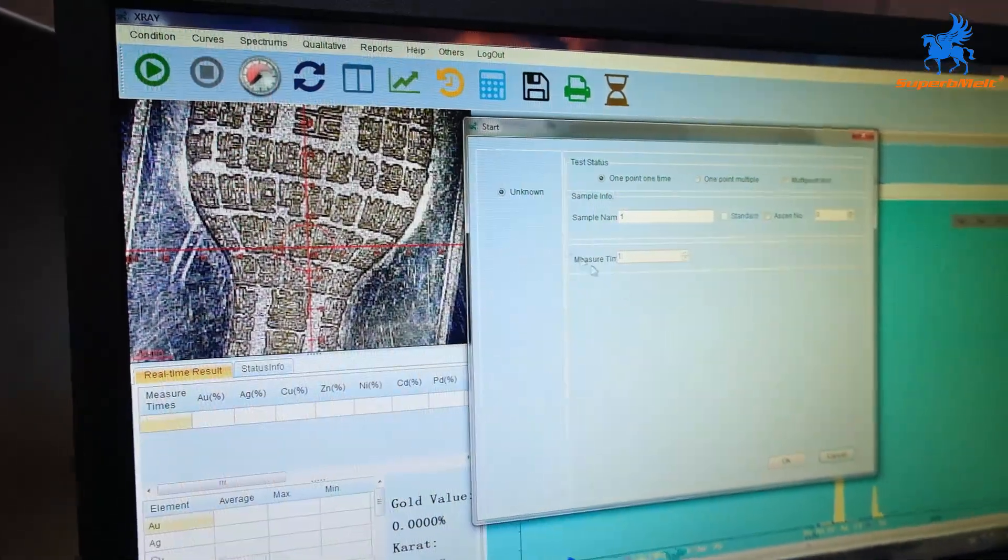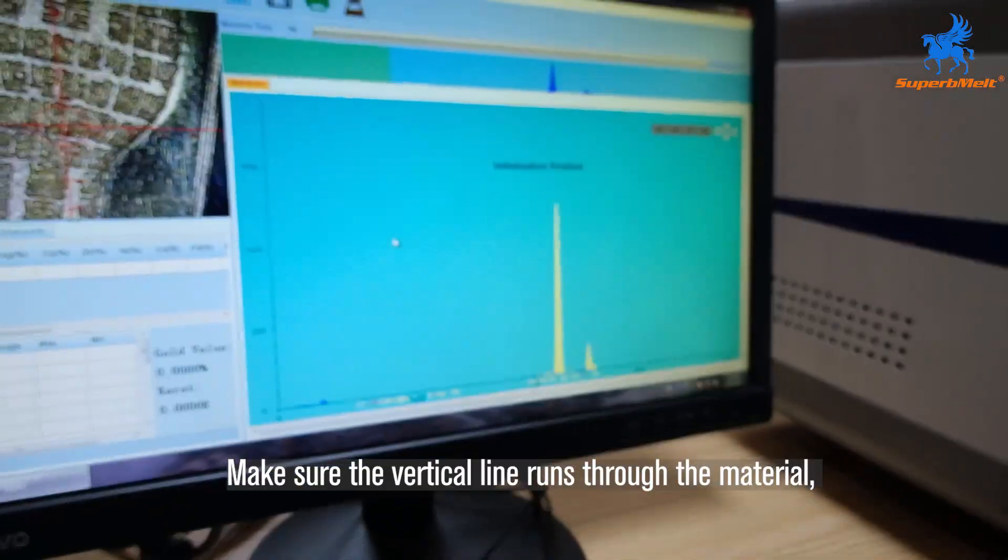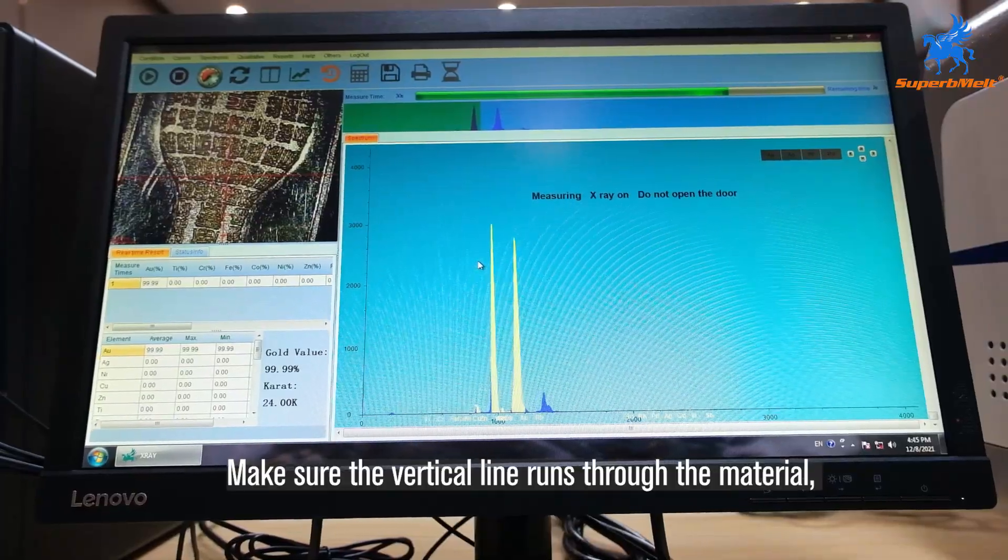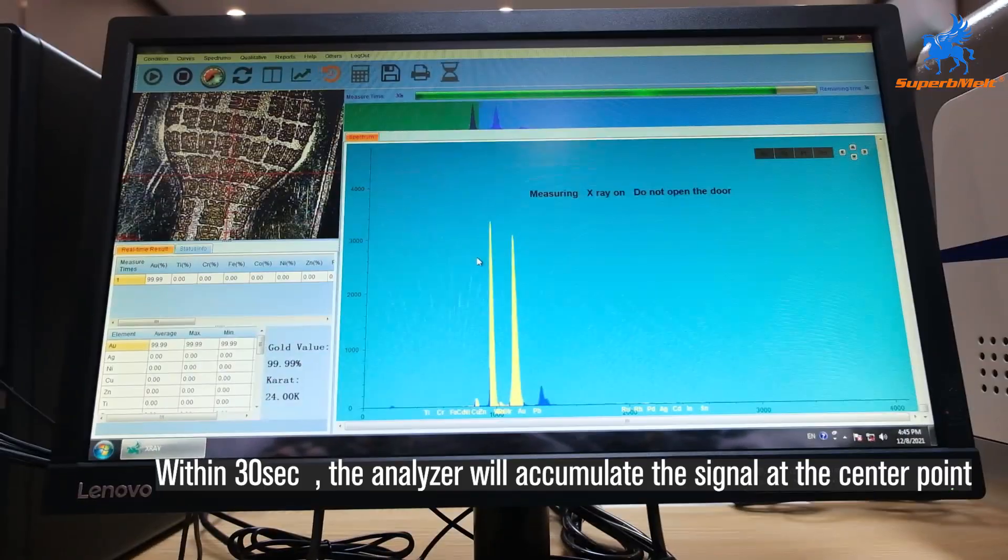Click the start icon. Make sure the vertical line runs through the material. Within 30 seconds, the analyzer will accumulate the signal at the center point.